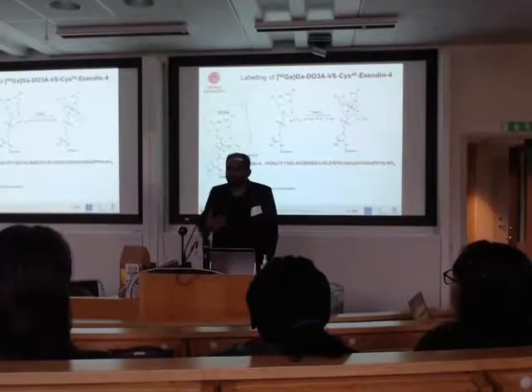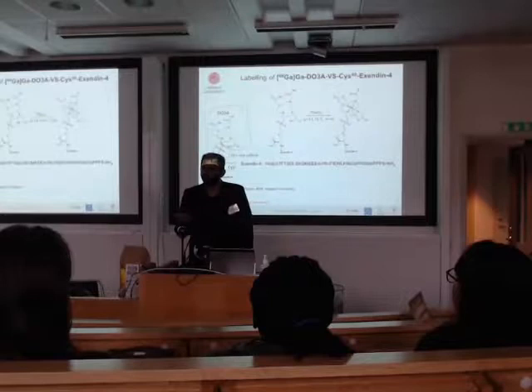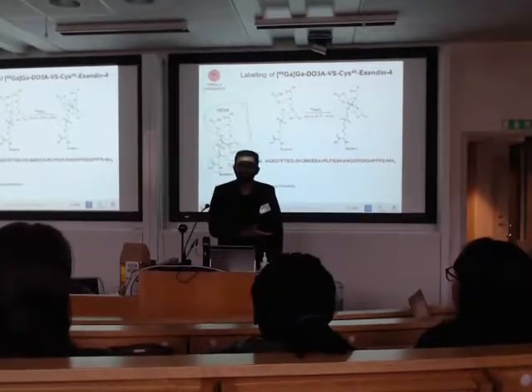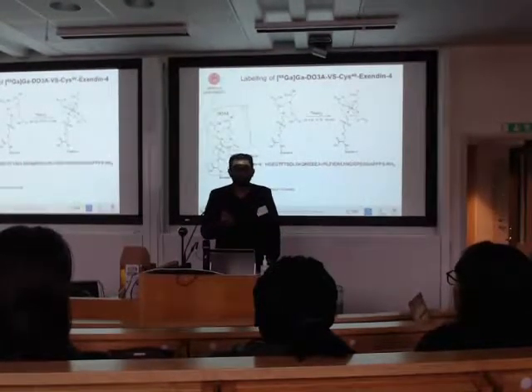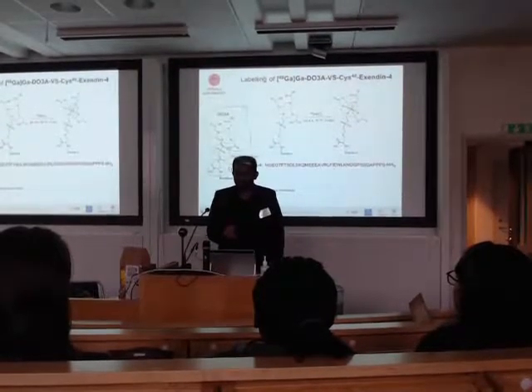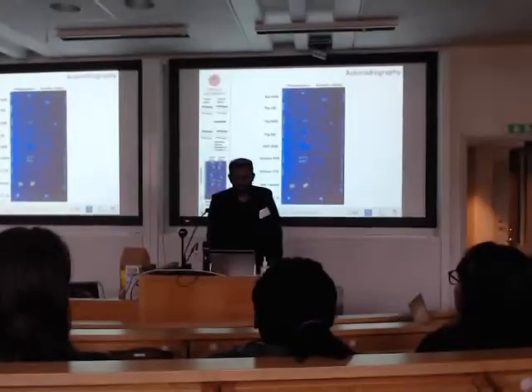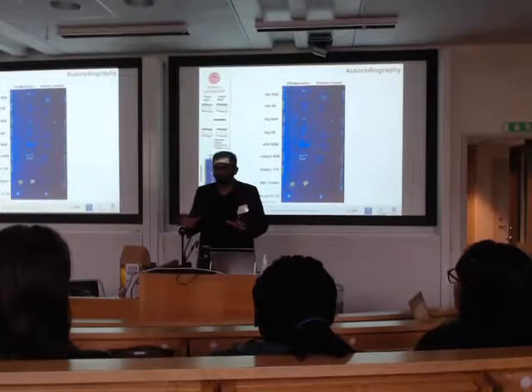We have the facility to radiolabel these peptides. To start with, you should prepare this radiolabeling of your peptides. If that fails, the rest of the pipeline is distorted. So we have the capacity to radiolabel these peptides. This is just to show an example: this peptide has been radiolabeled with gallium. We perform extensive cell studies as well. We are capable of that.